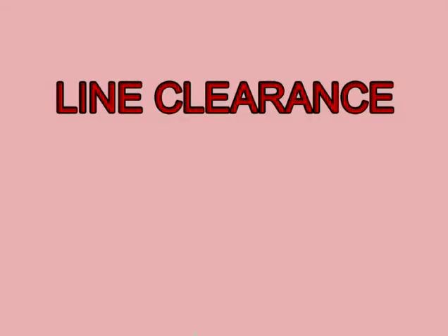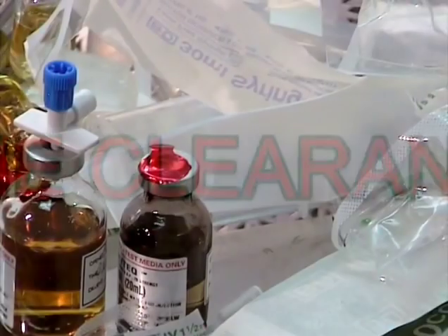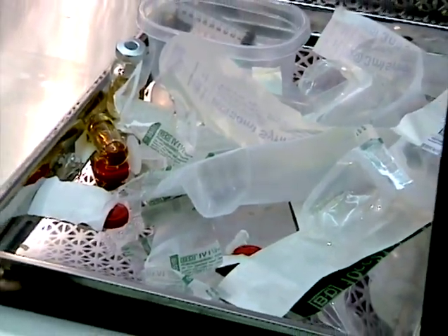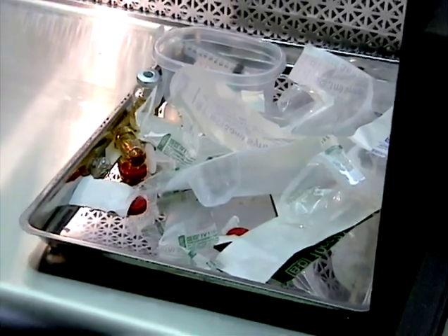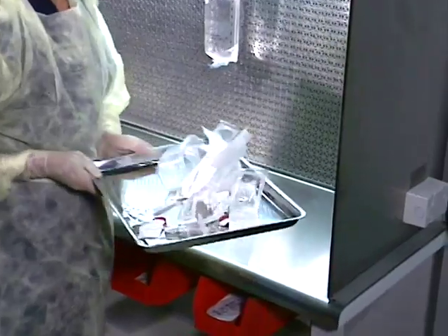Line clearance. Because many drugs may be a hazard to a patient for whom they are not intended, the line clearance is performed to assure that no drug or compounding residues remain in the critical work environment following the completion of compounding activities.